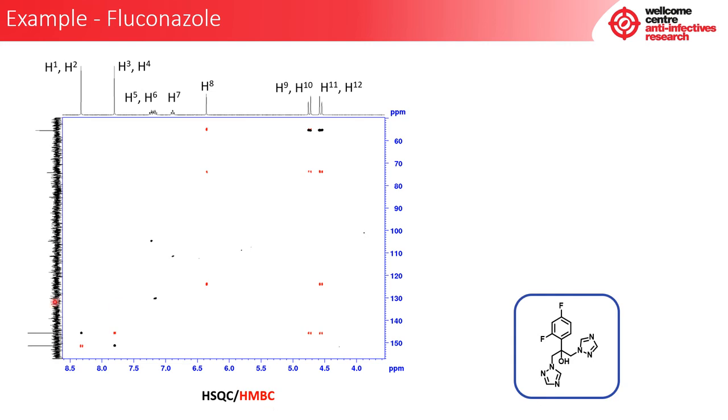Well, let's take a look at these peaks down here. What can we say? Protons 1 and 2 and 3 and 4 look to be potentially 3 bonds away, because the HMBC can see roughly 3 bonds away, 2 to 3, which is good. So we've worked our way from the black until we see an HMBC signal which is located here. How do we know what this one is? Well, there's the black line there. It's telling us that these see each other. So let's start to work again.